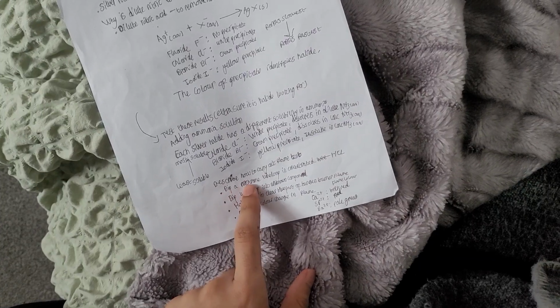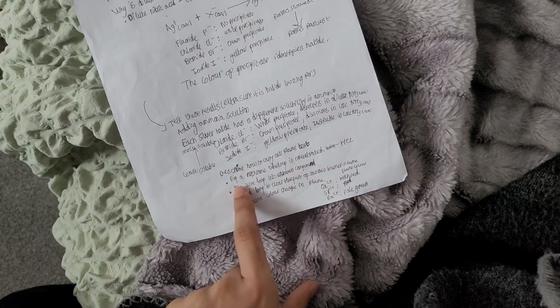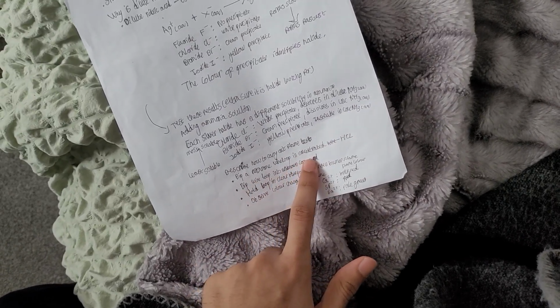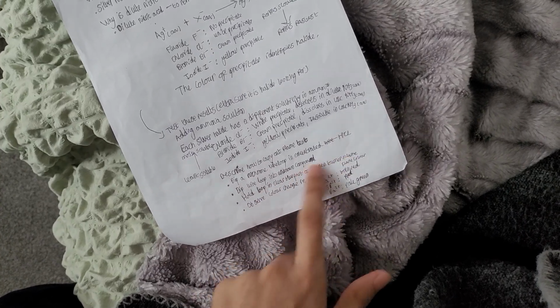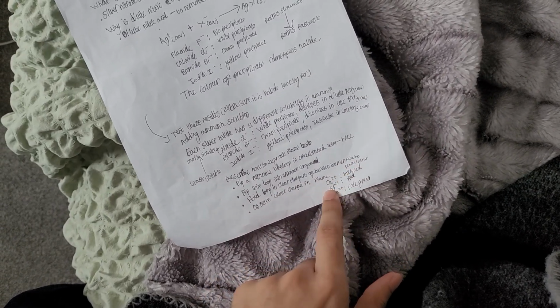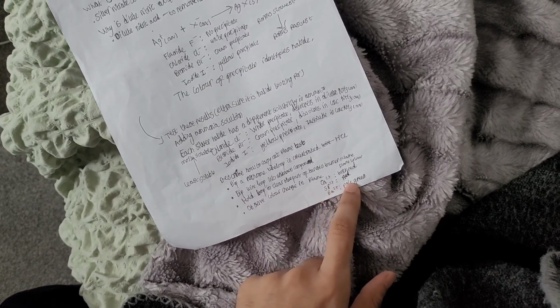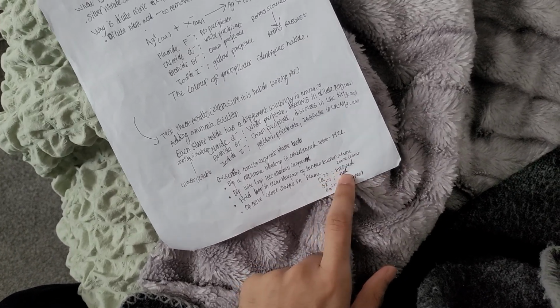So we want to dip a nichrome wire loop in concentrated hydrochloric acid, HCl. Dip the wire loop into the unknown compound. Hold the loop in the clear blue part of the Bunsen burner flame, and then observe the color change in the flame. If it's Ca2+, the flame color is brick red. If it's Sr2+, strontium, it's a red flame color, and if it's Ba2+, pale green. Ca2+, brick red; Sr2+, red; Ba2+, pale green.